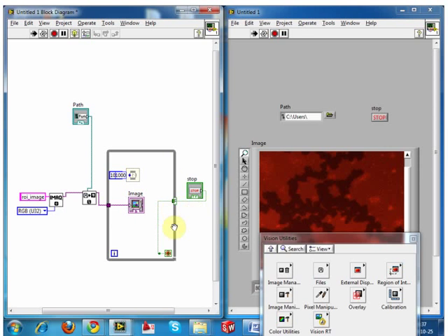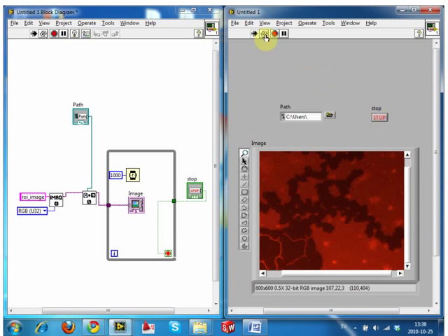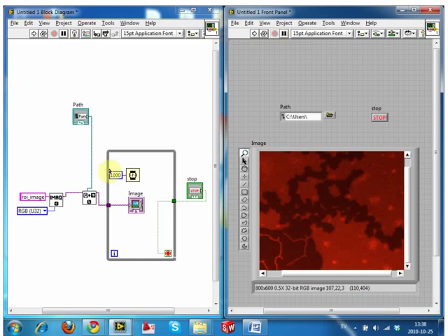So you have to be a little bit careful how you do this, because right now I don't have a button that will stop it. I have no way of stopping this loop. But because I have this really large time delay, my processor isn't being stressed, so I can hit stop at any time and it will stop. If this wasn't there or it was really short, this loop executes faster than I can push this button, which it will do. Then the computer will never essentially see me hitting the stop button. It'll just keep running the loop.